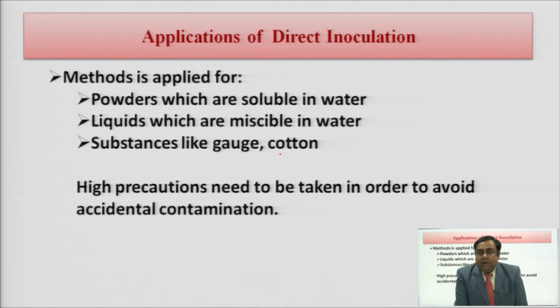A question may be coming up in your mind: why are we repeating this again and again? I am repeating this because if the environment where you are carrying out this test is not properly sterile, you will not be in a position to know, just by seeing the turbidity, whether the turbidity has been caused by the environment where you are carrying out this test, or it is due to the substance not being properly sterilized, that is your sample.